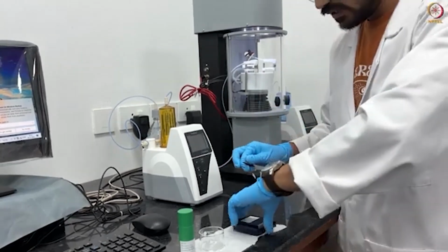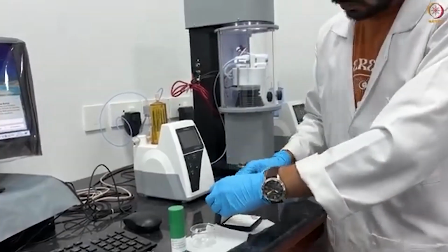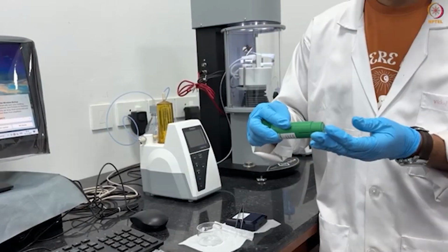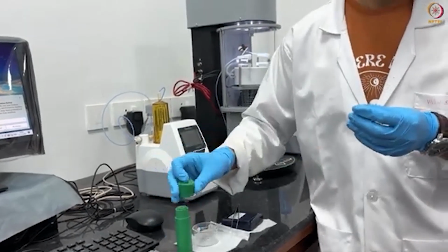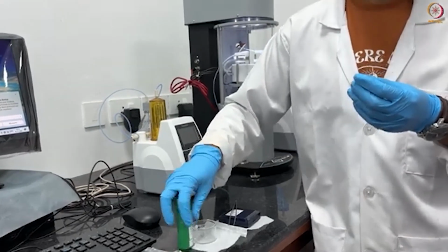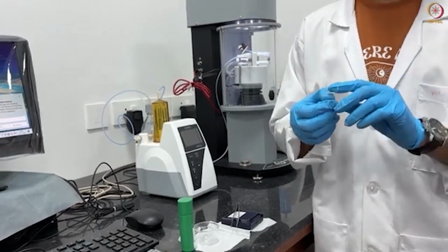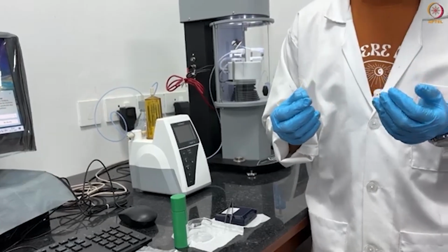Now let me show you the Du Noüy ring, also known as the ring type plate. This is our ring type plate, as you can see here. This is the Du Noüy ring plate used for the measurement geometry. You can see it has a perfect ring shape. This one is also made of platinum. It will hang in the system for measuring surface and interfacial tension and other parameters.